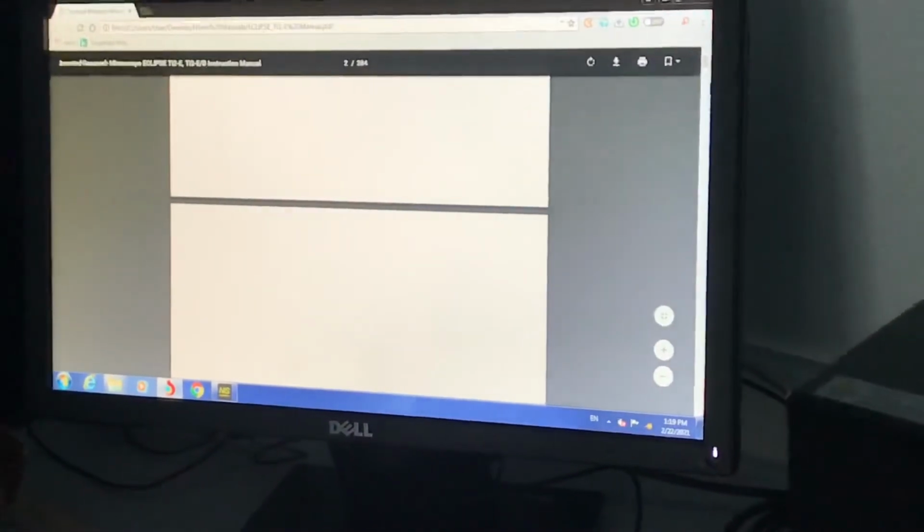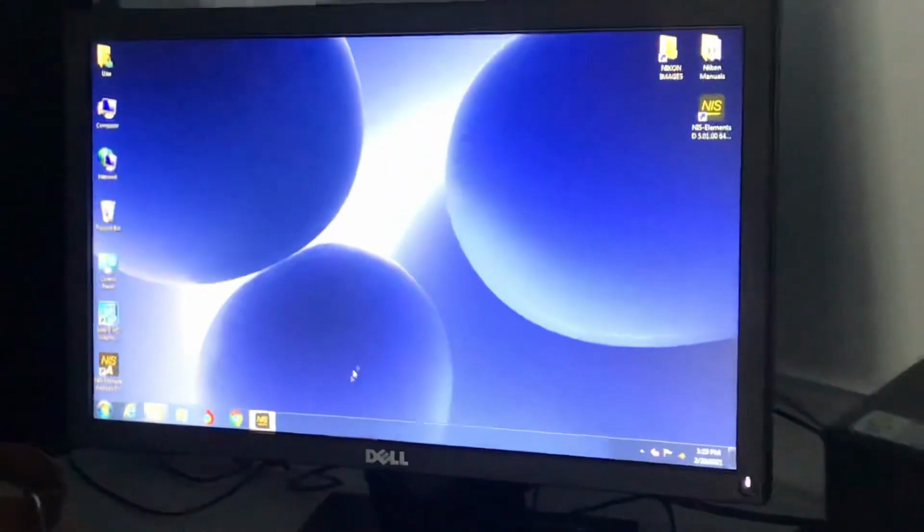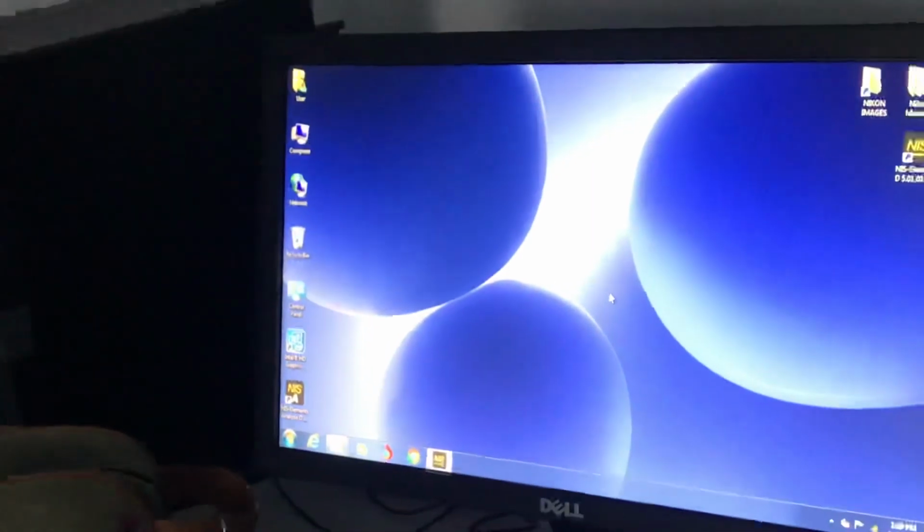And this is a microscope manual. Inshallah, I don't want you to go through all this. You can let me know anytime. I'll be of help, inshallah, however I can, but just for your information. So now, if you want, you can bring your sample for a quick check.